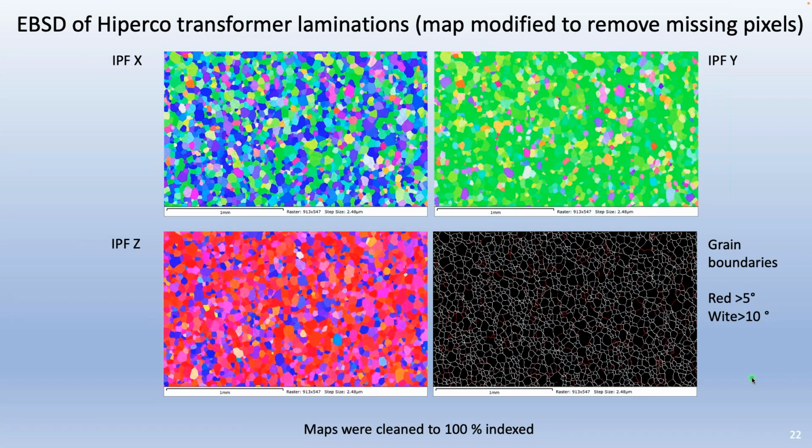You know, it's probably all ion beam made, but some people are still electropolishing, which gives you a little bigger area to look at. Sample prep has to be discussed. Your spacing of your pixels has to be chatted about. How you cleaned up the data. So it then becomes the same sort of thing that I just talked about.